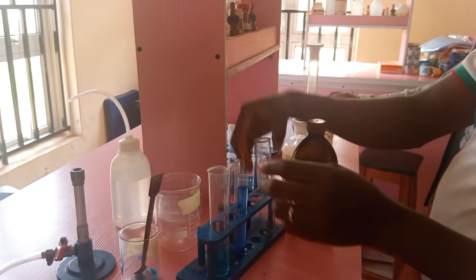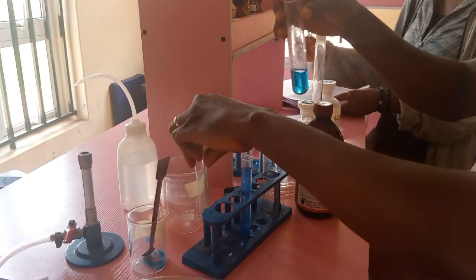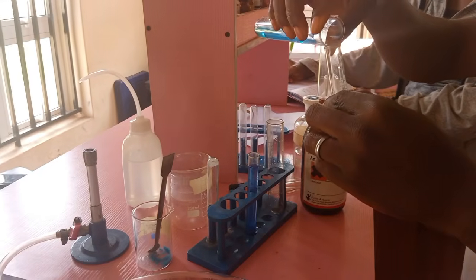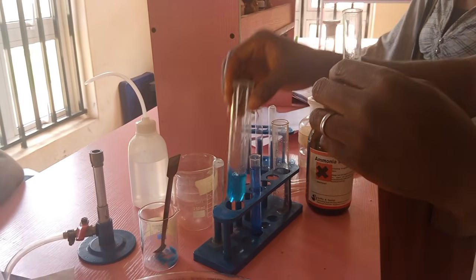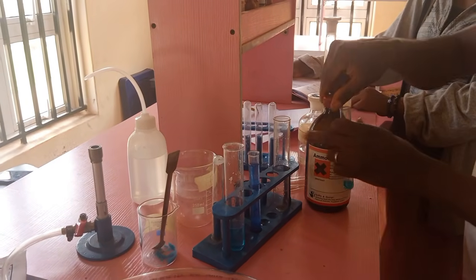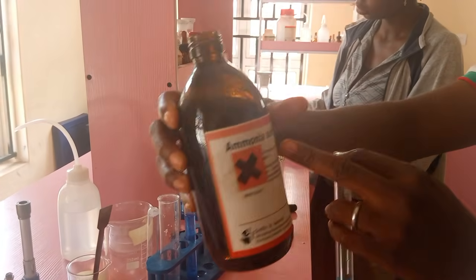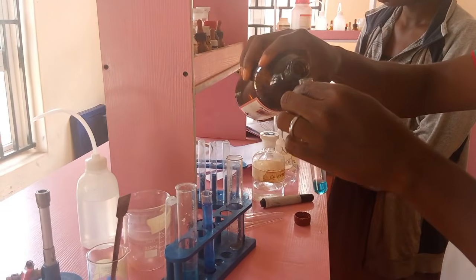Okay, now we are going to put this in the second one. Get another test tube. We add this here. Now we add ammonia. This is ammonia solution. We add ammonia in drops.